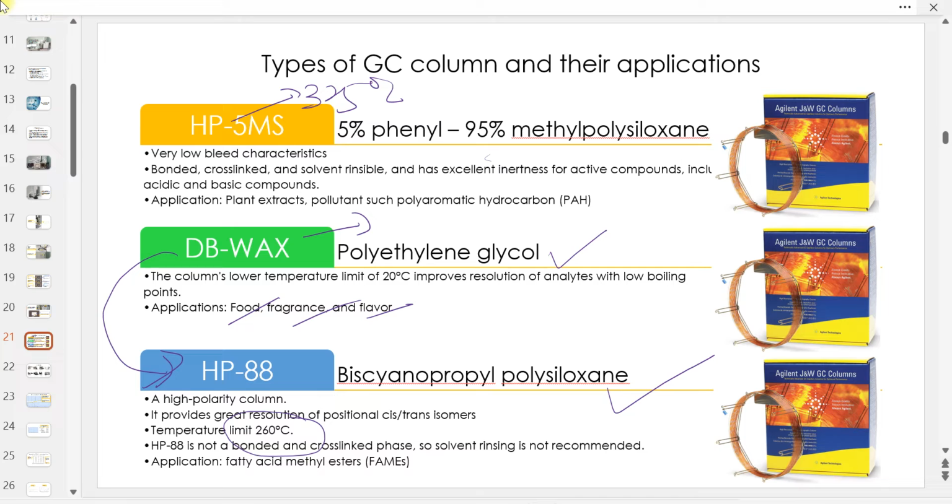Oh, okay. So, maksud dia macam dia ada letak satu lagi special packing pada kolom tu. So, dia tak mudah, apa tu? Solvent tu sendiri takkan mudah retain lama dekat dia. Helium tu boleh tolak je keluar nanti bila dia nak run. Okay. Tak ada carry over semua lah. Tapi itulah limitation dia, suhu dia 260 degrees je. You tak boleh go high lah. Okay. So HP88 is very specific kalau you nak buat analisis.